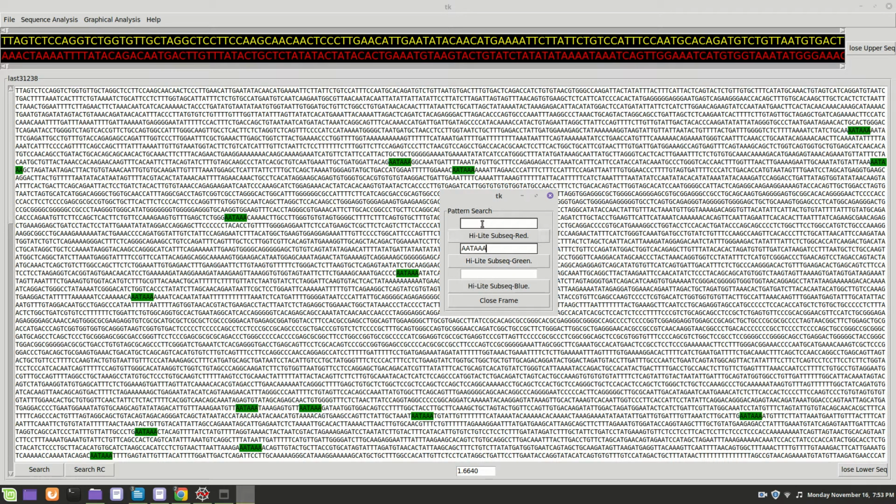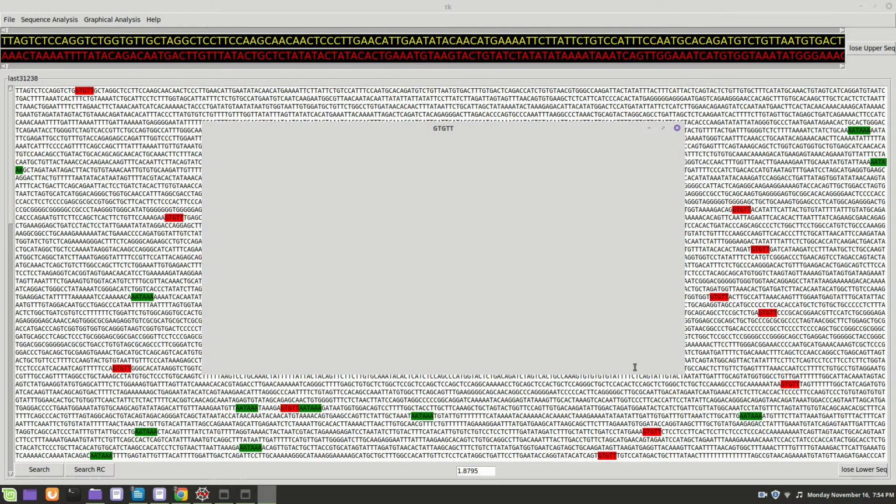So what's the other one to give us a clue about this polyadenylation, where it should be? Well, the sequence is GT. Or it's actually U, but we're using T's, of course, because that's the way FASTAs work. GT. And we do search, and here we go.